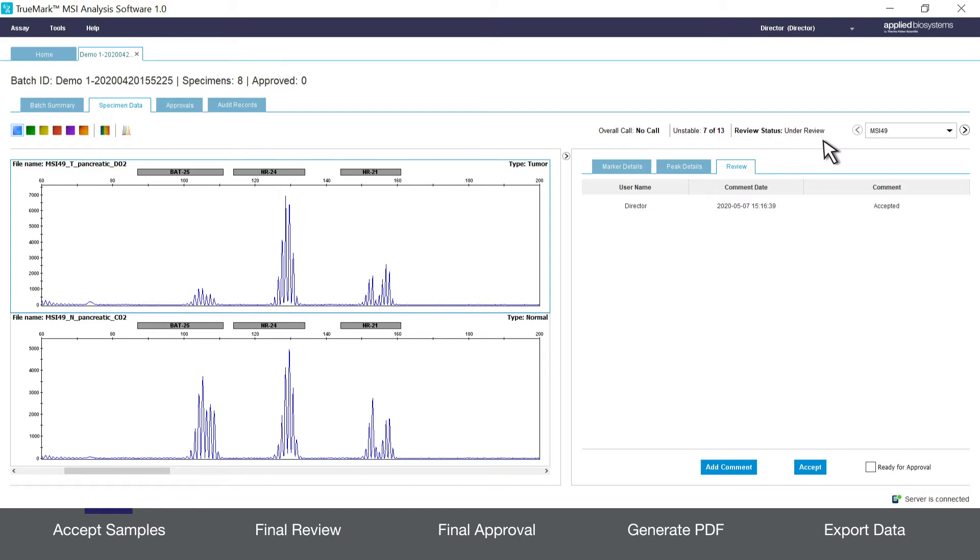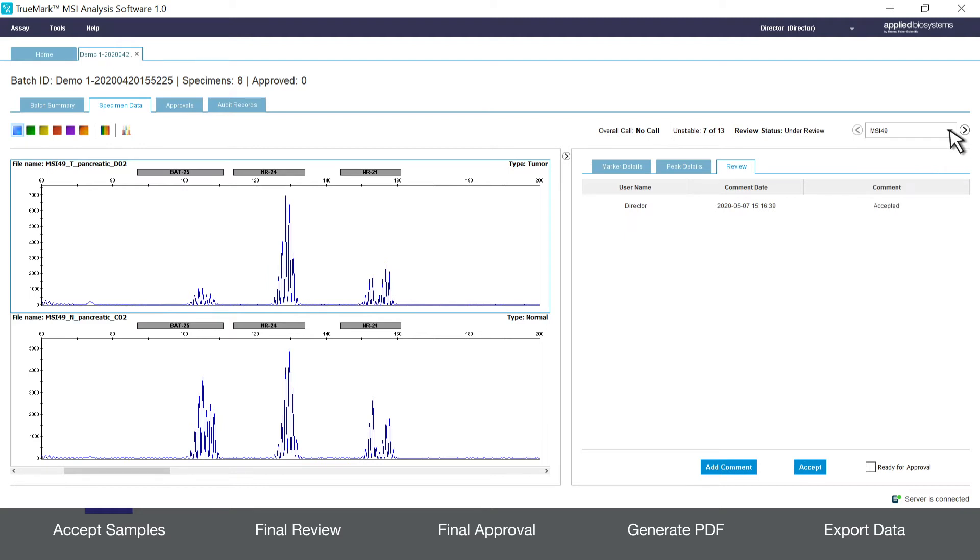To move on to the next sample choose it from the sample drop-down menu at the top right or click the arrows left or right.